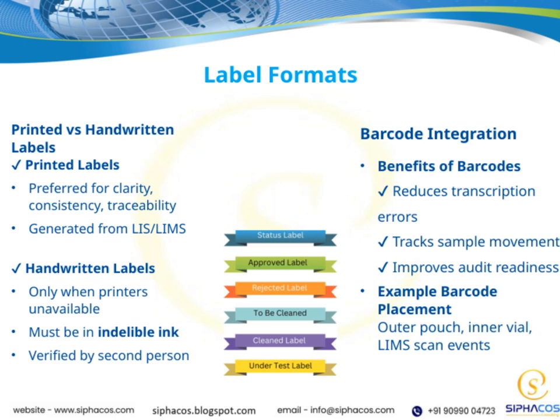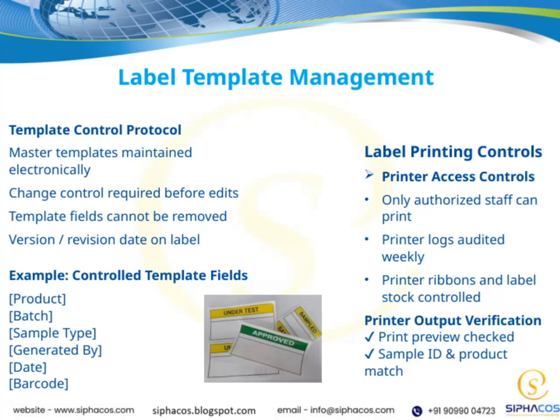Lastly, there are different label formats to consider, depending on the sample or situation. Choosing the right format helps us maintain consistency and integrity throughout our workflow. Let's take a closer look at the controls we have in place for label printing.